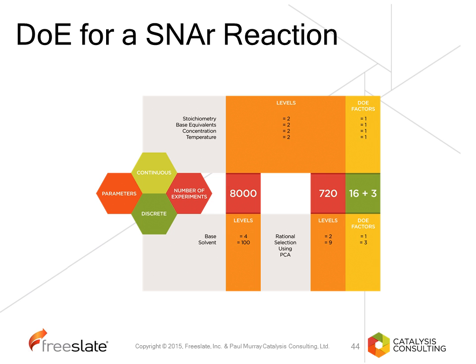If we take any of these factors through, still 720 experiments is too many to carry out. If we apply DOE, we can do this in 19 experiments. So 16 experiments plus 3 repeats. But based on these, we can study this in 19 experiments, and we would take 4 to 5 samples from each one of those reactions. And automation will simplify that considerably for you.